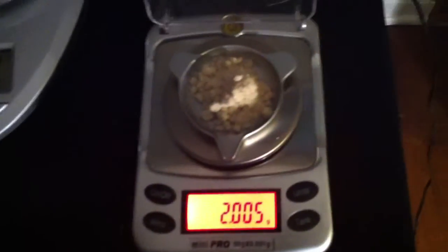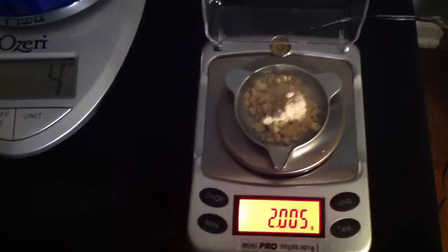Now I'm going to be careful to seal this back up. Just like storing normal RU, you probably want it to be airtight. It's probably a little more stable at room temperature, but I would still like to store it in the fridge just for safekeeping.